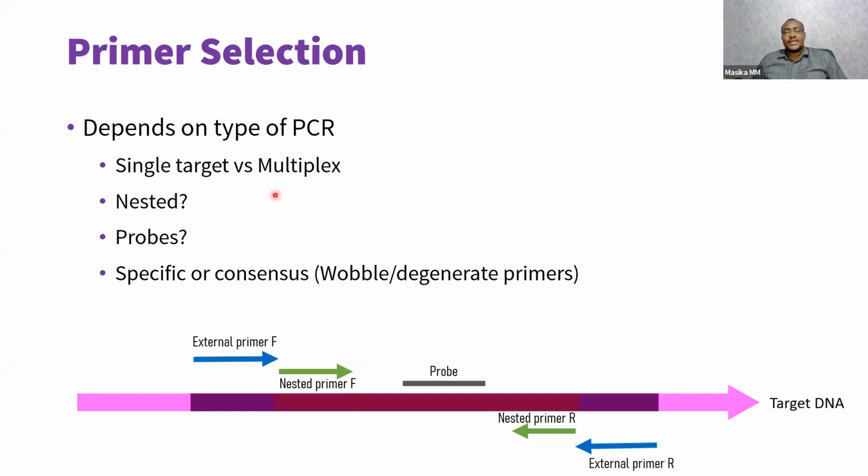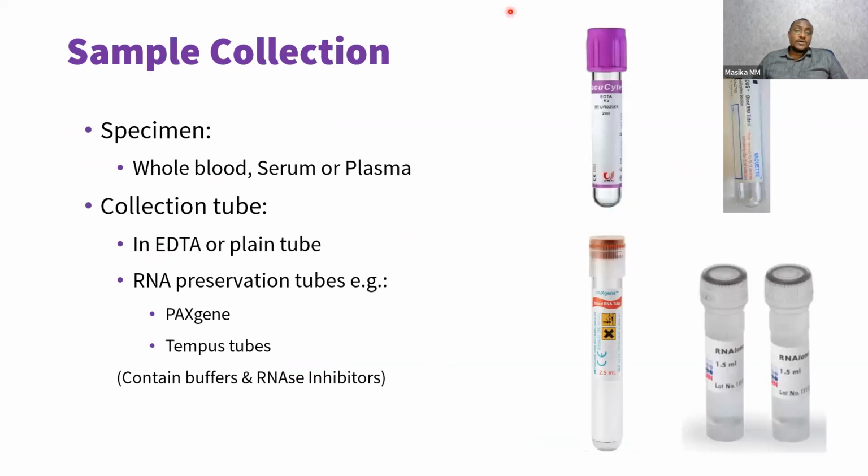But by and large, we are today going to focus on discussing single target PCR, which is the primary PCR that we are interested in. The rest I've just put here for the sake of literacy. Okay, I'll pause here for questions as I can see some of the chat.